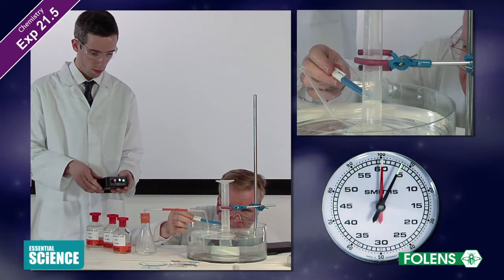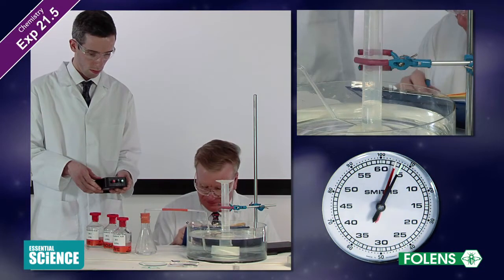When the reaction is over, note the final volume of hydrogen collected and then wash out the conical flask.